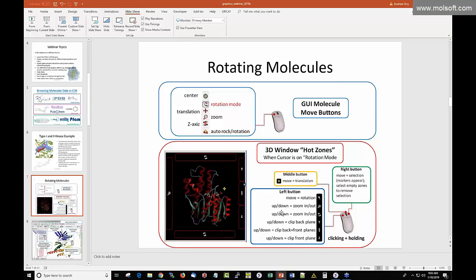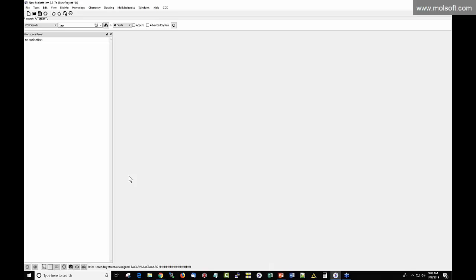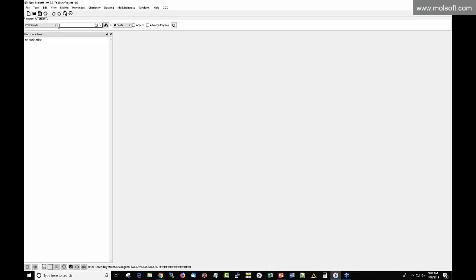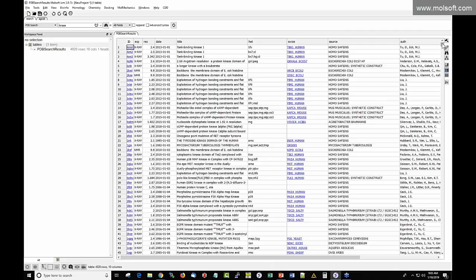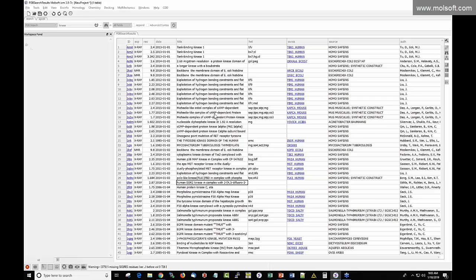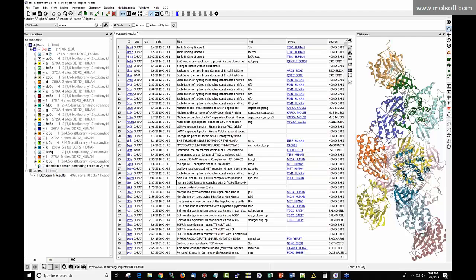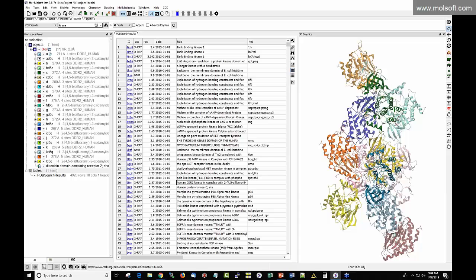Let's go to ICM. When you open it, you see options to search multiple databases. Under the search tab you can search the PDB — for example, typing 'kinase' as a string and clicking Run Search returns over 4,920 structures annotated with the keyword kinase. You can double-click any entry in the results table to load that structure. You can also search with a single PDB code, which we'll do in a moment.